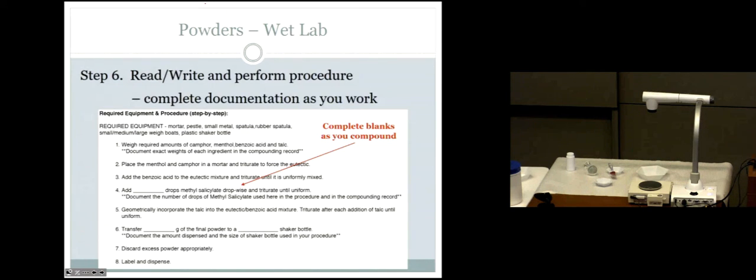One thing I will tell you about the process, remember, you must be wearing gloves and your white lab coat when you start to get your chemicals. So as soon as you start to go get chemicals, make sure you've got gloves and white lab coat on. One chemical at a time. You've got 4 things you have to go get, but you go get 1 chemical, set it back down, take your weigh boat, go get the next chemical, and so forth. So do 1 at a time.